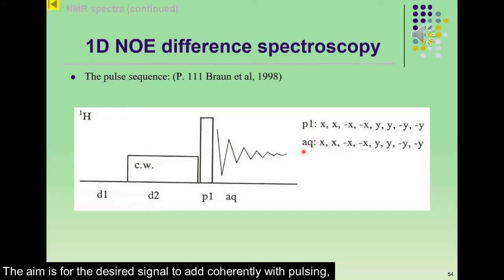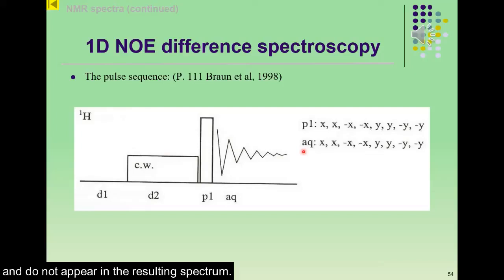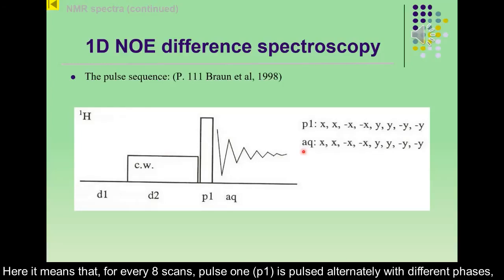The aim is for desired signals to add coherently, whereas all other unwanted signals cancel at the end of the cycle and do not appear in the resulting spectrum.